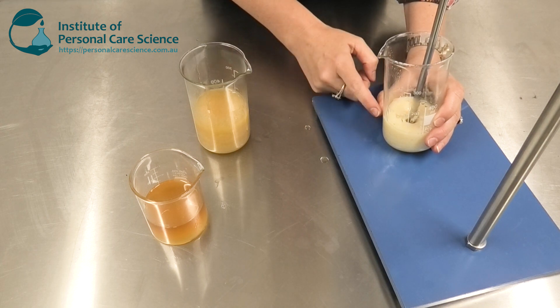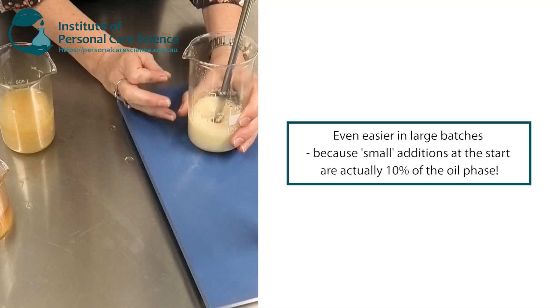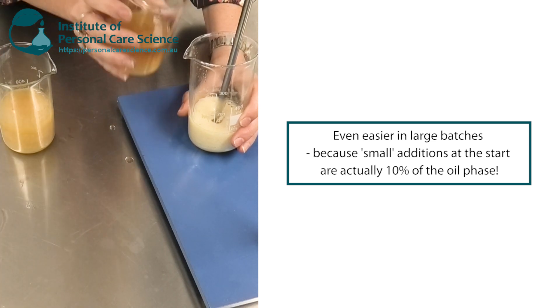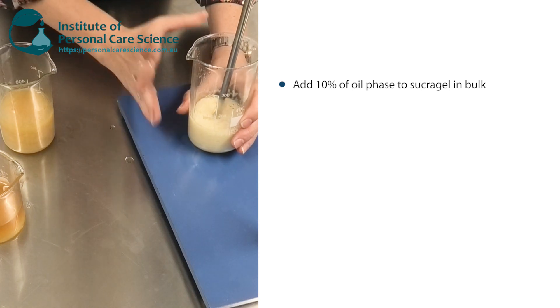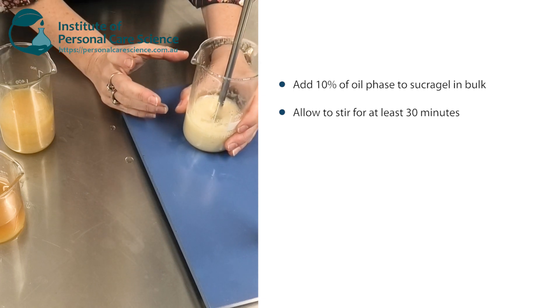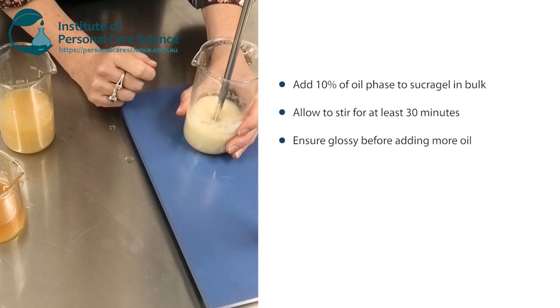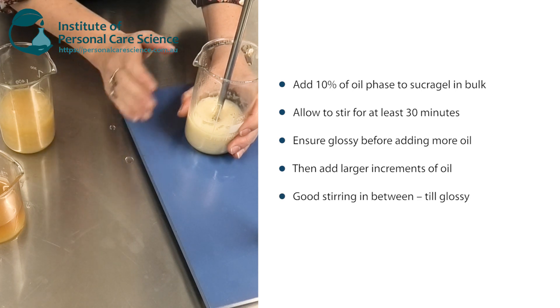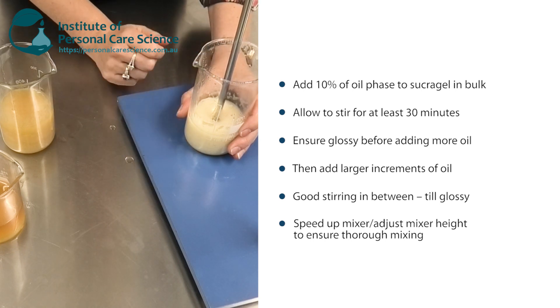I'm going to turn the propeller speed up a bit and remember I'm really looking to see that gloss before I add more oil. In case you're wondering how this works with scale-up — when doing larger batches it's even easier to get right, because a small amount in a large batch is a much larger amount than what you're working with in the lab. You start by adding about 10% of your oil phase to the sucragel in a bulk production batch and let that stir for a good half an hour, just so it can start to form that external structure. Then you can start adding more oil slightly faster, turning up mixing speed and shortening the time between additions.